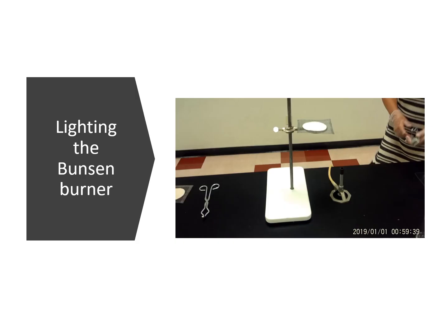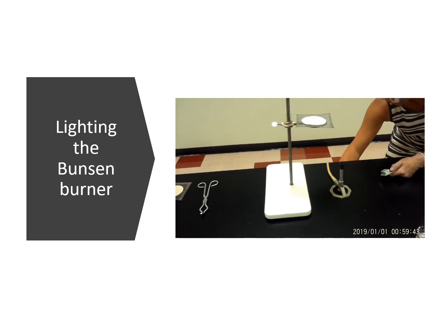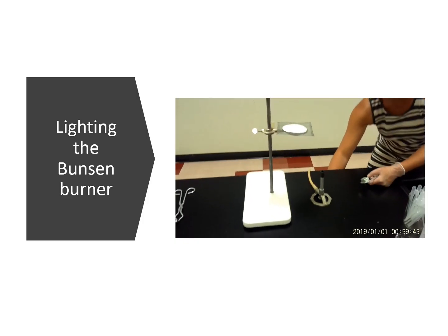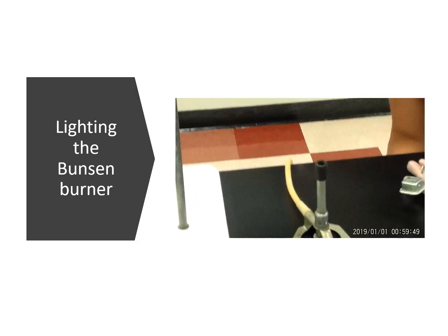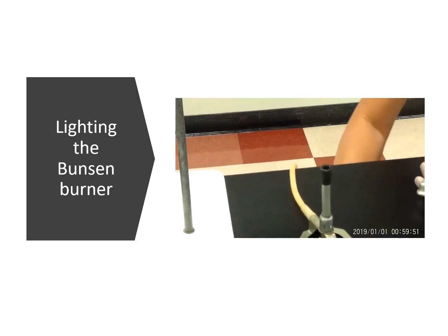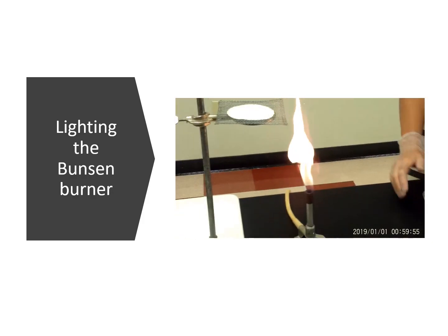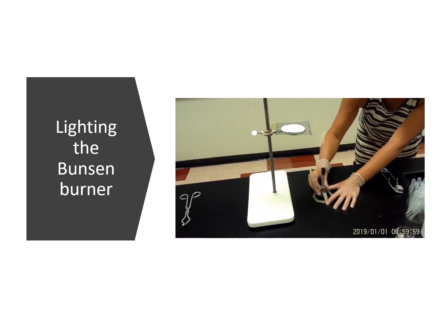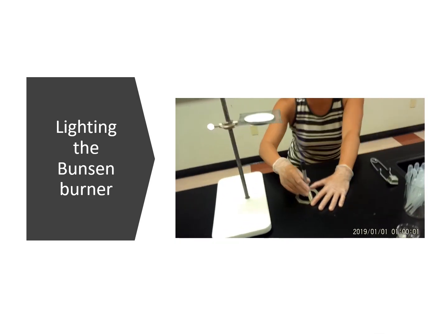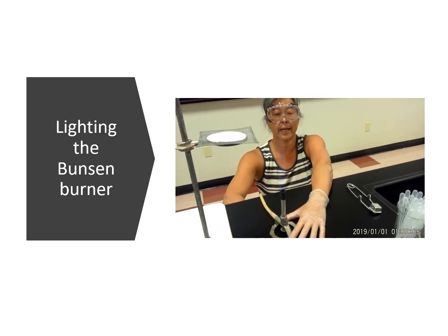So let's talk about lighting the Bunsen burner. When we start lighting a Bunsen burner, we're going to turn on the gas. And you can hear it going. That is a luminous flame. Once we get the luminous flame, we're going to adjust the oxygen, and the amount of gas.